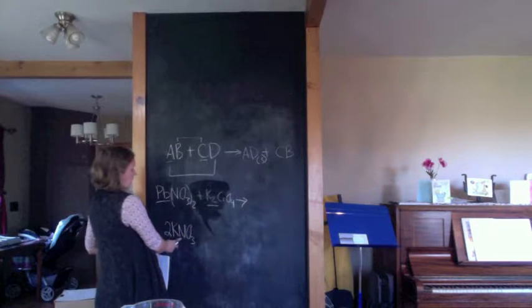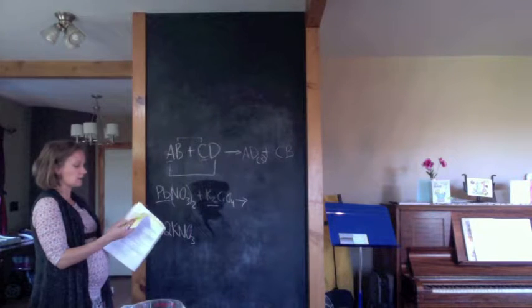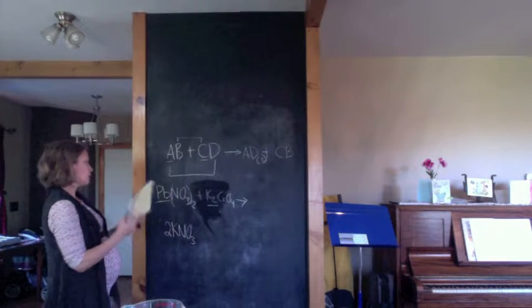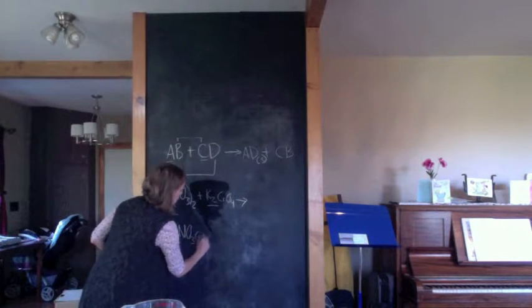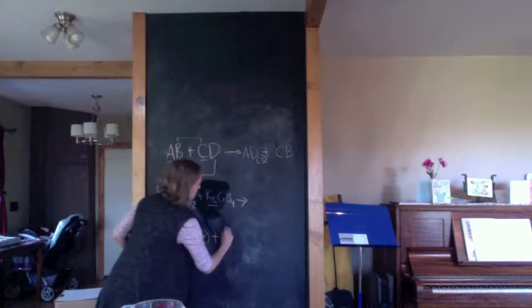So this is one product. Based on our solubility rules that you have on your periodic table, or in the back of your lab manual if you bought one, you'll be able to tell what's soluble. So nitrate, I see rule number 2, is always soluble. This is aqueous. And our second product will be lead chromate.